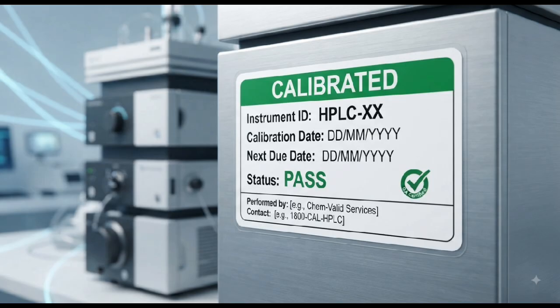Calibration label. After successful calibration, the instrument status should be updated according to the laboratory procedure. Where applicable, the calibration label may identify the calibration status and due date. If an instrument fails calibration or its status cannot be confirmed, it should not be used for routine analysis unless specifically permitted under an approved procedure.